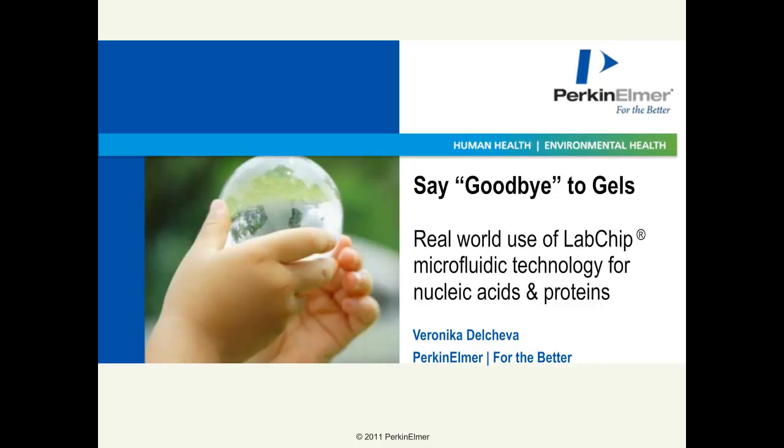Thank you, Paul. First of all, welcome to the last presentation of today's webinar. My part of the session will be dedicated to the LabChip microfluidics technology and how it can replace lab gels for the nucleic acids and the protein characterization.